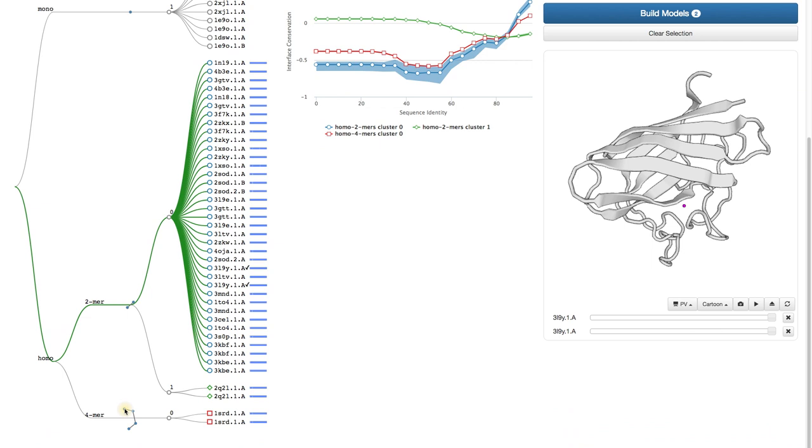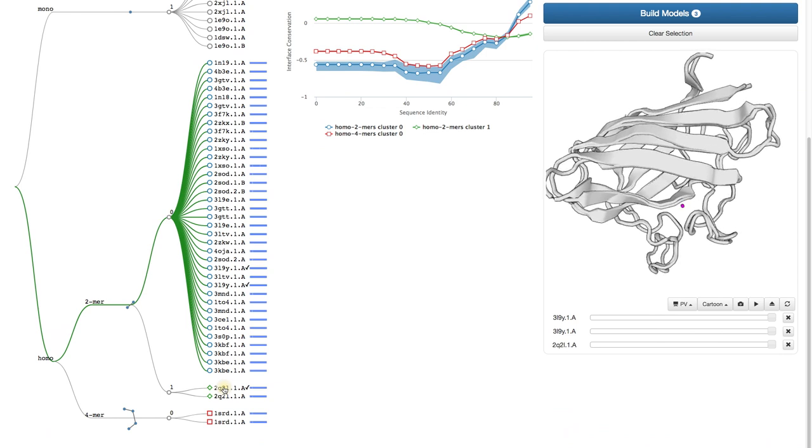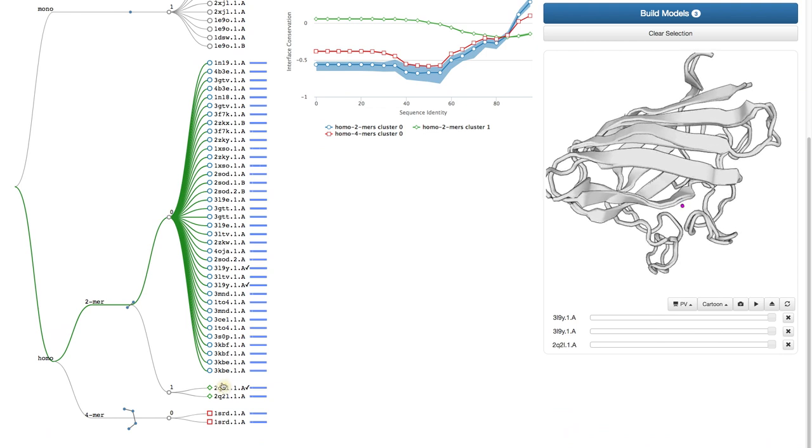The last level clusters according to interface similarity, meaning how the protein chains interact with each other. Let's select one to see afterwards what this means exactly.